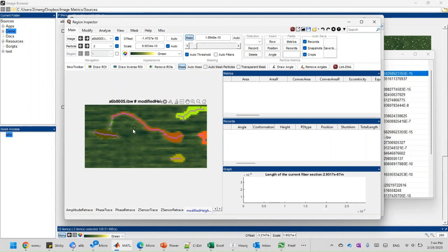So you see the mouse turns into a circle. There's a circle in the image, right? That's our eraser, so you know it's in eraser mode. In this eraser mode, there are a few things you can do. If you simply press and drag your mouse, it's making new masks. For example, I drag these. It makes a new mask, and it connects the DNA, right? The other thing you can do is press Shift and then press and drag the mouse. In eraser mode, it erases the mask, right?